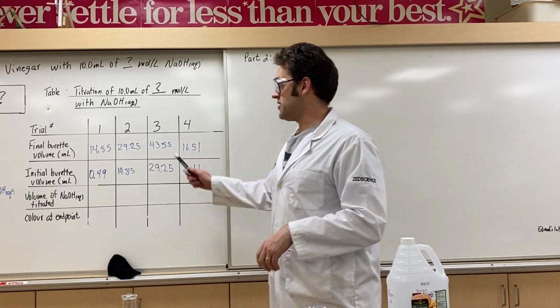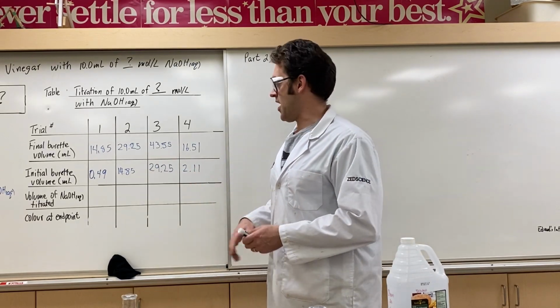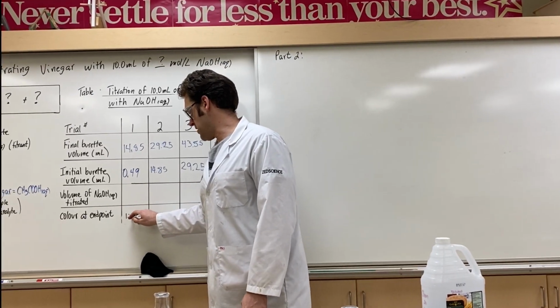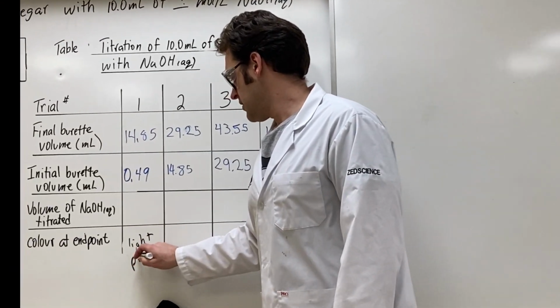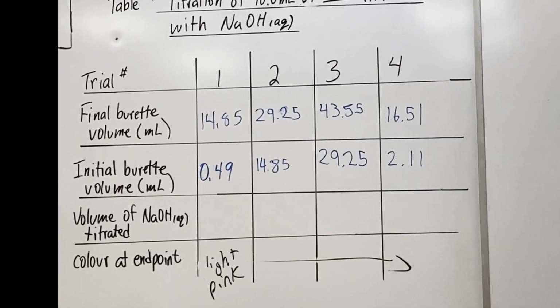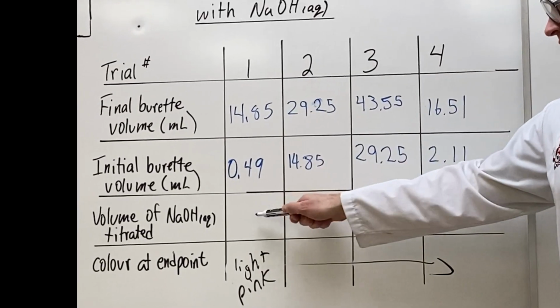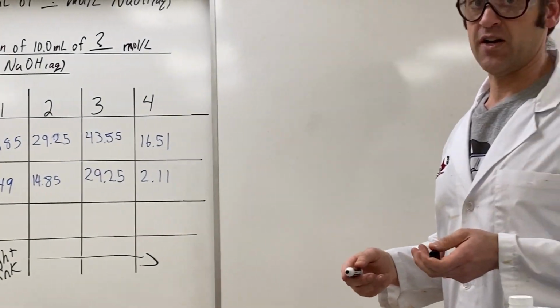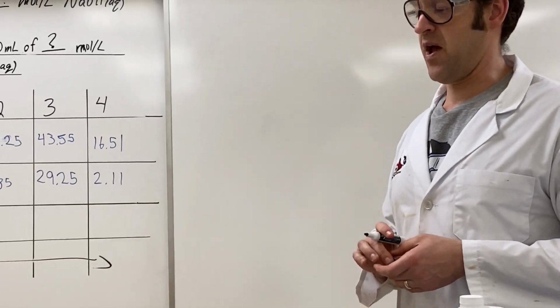Okay, so we did subsequent titrations. You can see all our data's there. All of the colors at the endpoints were light pink all the way across. So the first one was light pink. All of the other endpoints were light pink. You still need to subtract these and see if they're all good data. Throw out bad titrations. Remember, we talked about that. Bad titrations you don't use in your math.